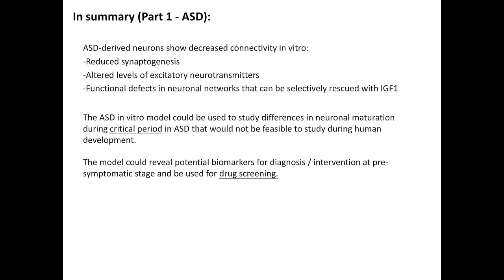So in summary, for part one, ASD-derived neurons show decreased connectivity in vitro. We showed reduced synaptogenesis, altered levels of excitatory neurotransmitters, and functional defects in neuronal networks that can be selectively rescued with IGF-1.